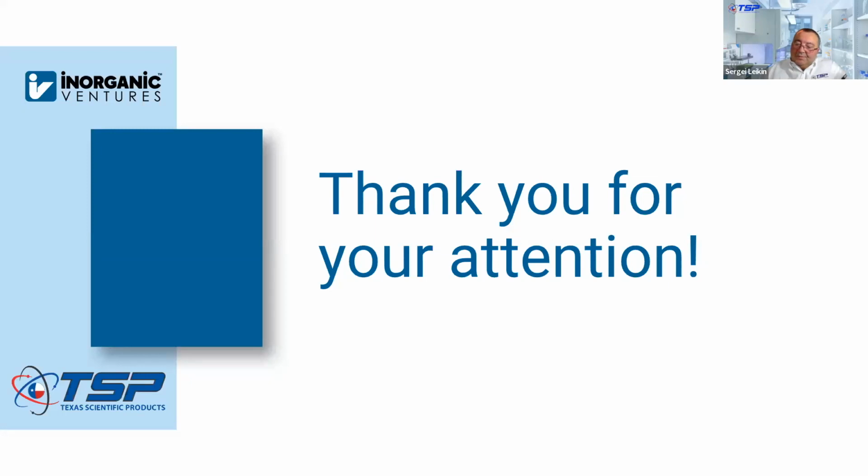Yeah, ICP optical emission and ICP mass spec, in my view, are complementary techniques. The common thing is the source. Both have ICP, inductively coupled plasma. ICP-OES, as we call it, is an optical emission instrument, and MS is mass spectrometry. Mass spec is generally more sensitive than ICP emission, probably in the order of 1,000 times. So to choose between them, it really depends, but typically if you're looking for extremely low detection limits, this is where you go to mass spec, and when you have tough samples, you use ICP emission.